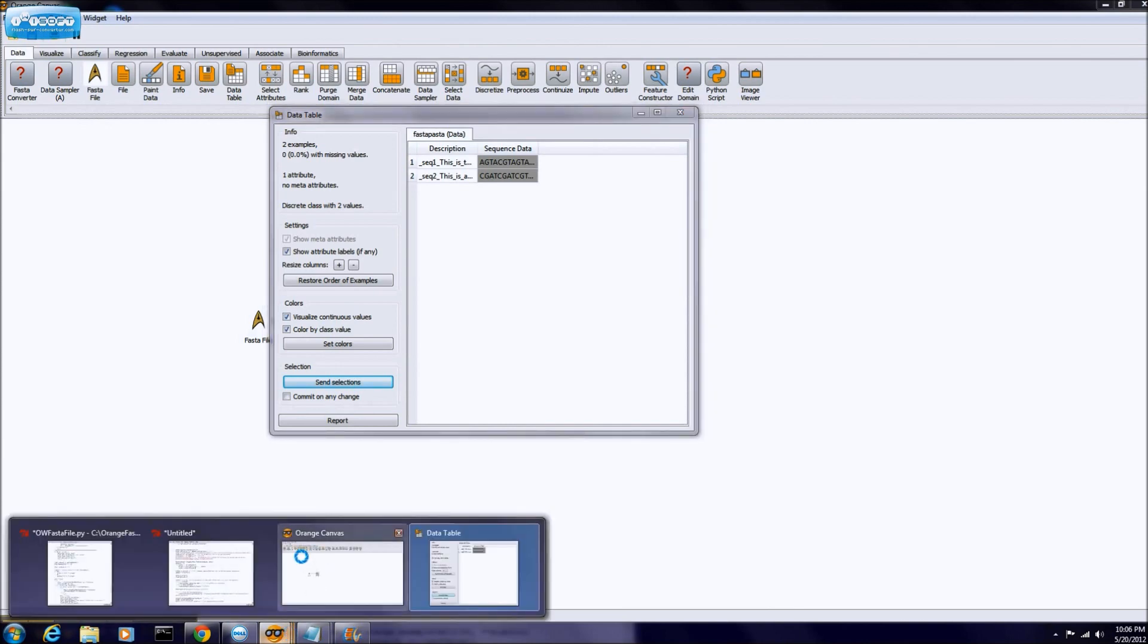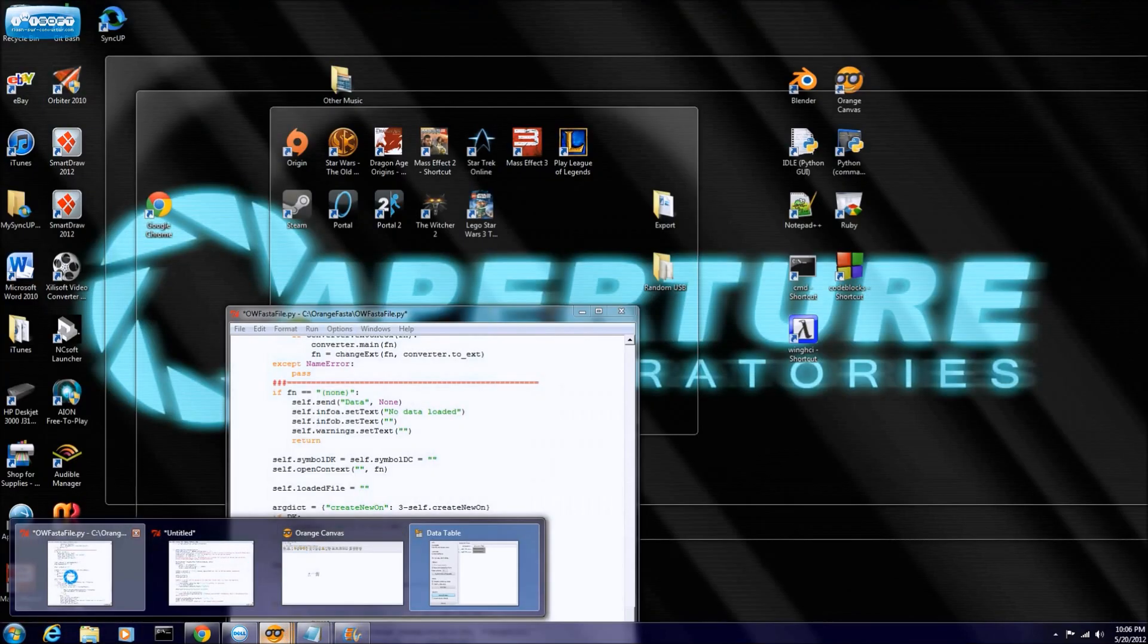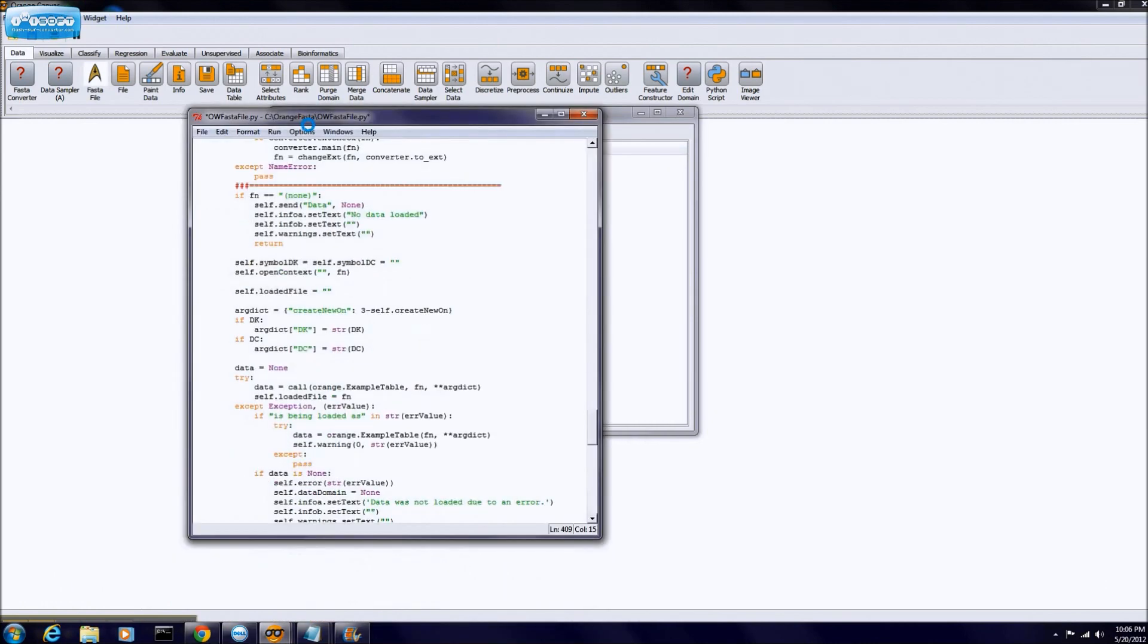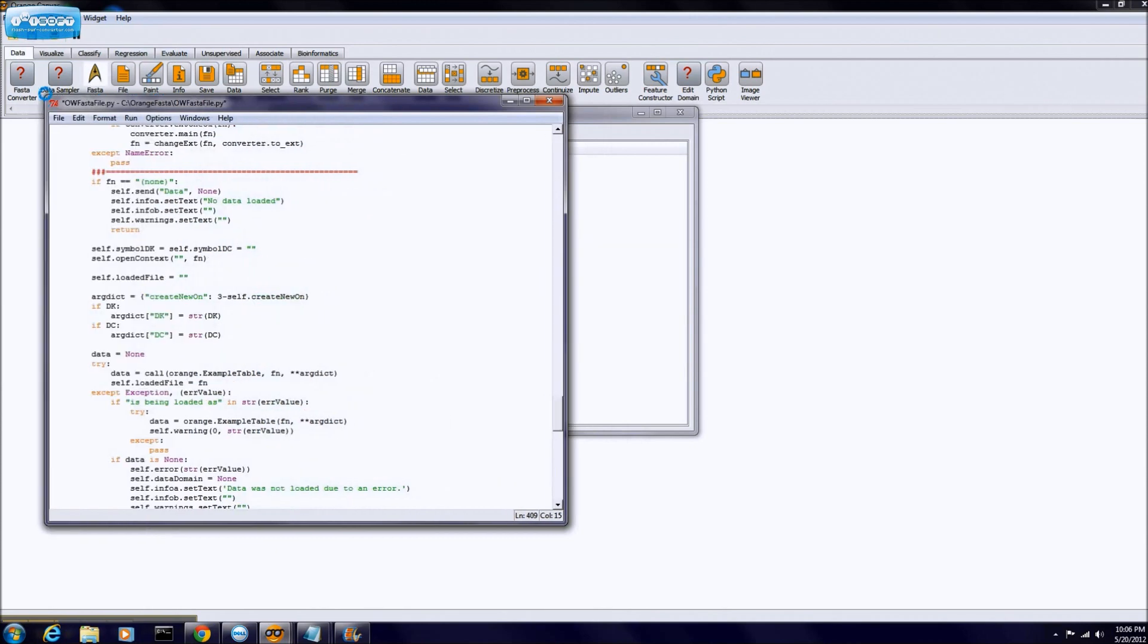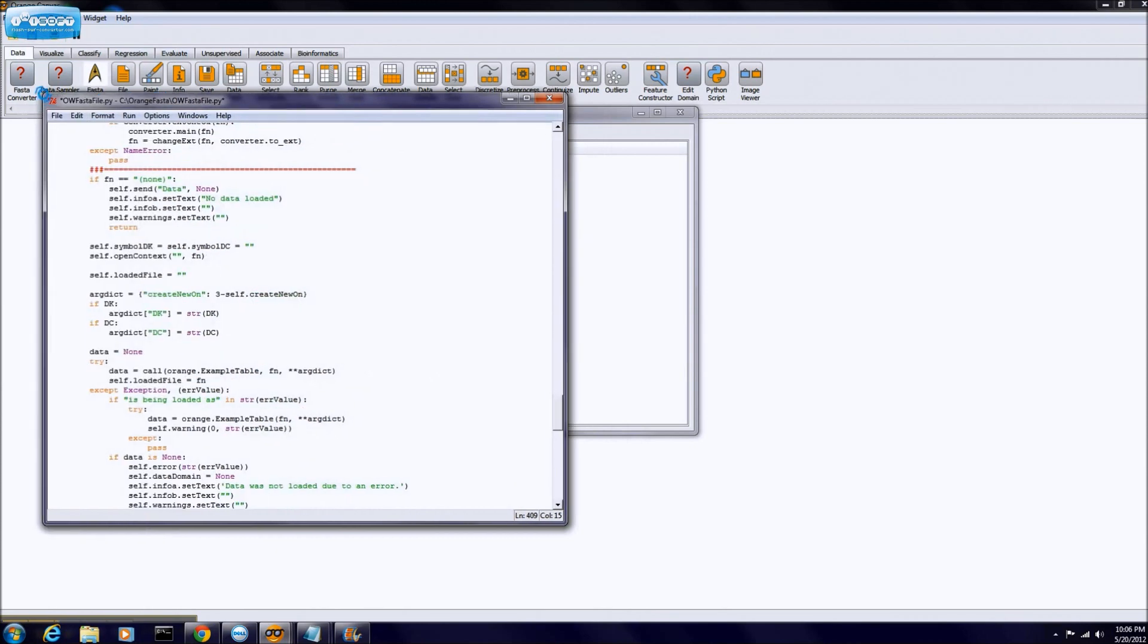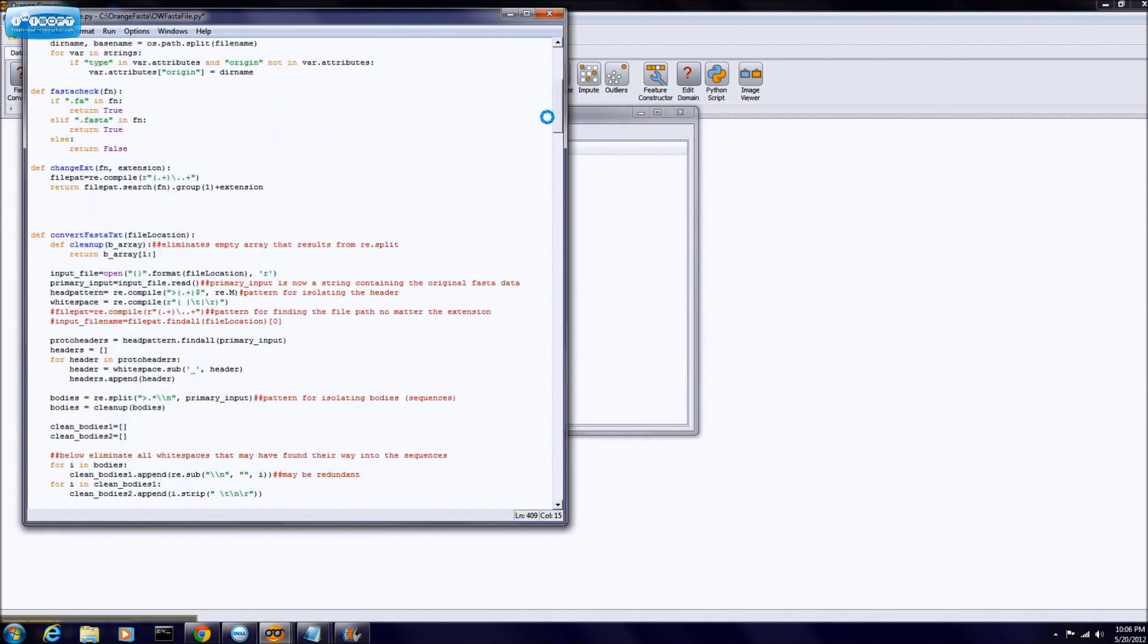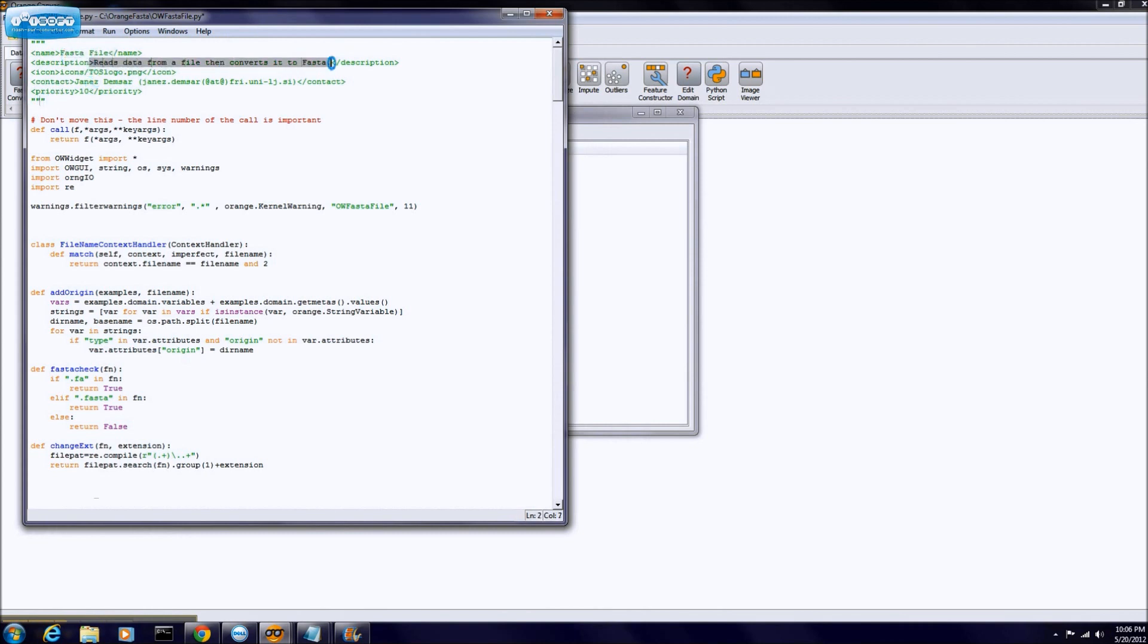So next, we got our orange widget code, which is basically just the file widget code, except modified. You know, like how you change a car, add some engine parts. So basically, to do this new widget, it wasn't very hard. All we had to do was, we changed the header, made it instead of file, just FASTA file. We changed the description, said what it did, changed the logo, and changed the priority.